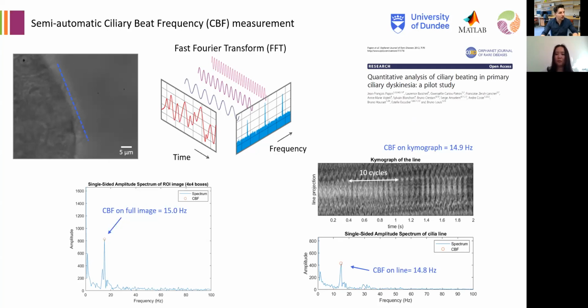Not that I'm aware of. It's actually not hard to do, because it's just a matter of saving a line and then projecting it as an image. So the code behind it is somewhat simple. It's even possible that you might be able to find pre-written code on forums that are looking into it. I'm not aware of something publicly free and already written, but it's not exactly hard to pursue.